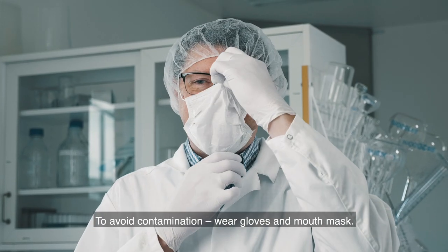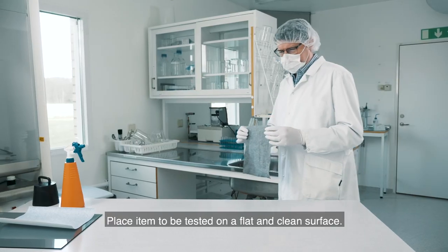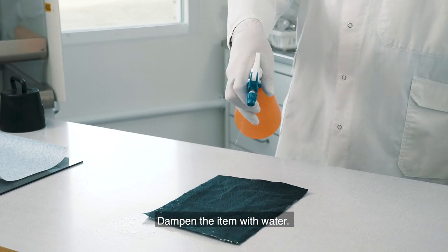To avoid contamination, wear gloves and mouth mask. Place item to be tested on a flat and clean surface. Dampen the item with water.